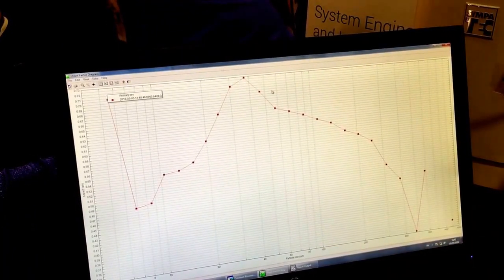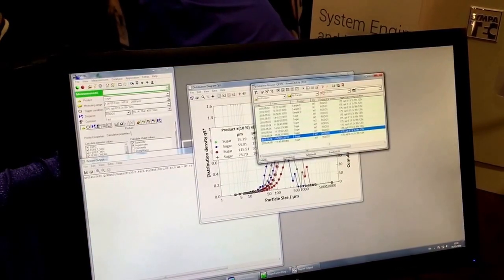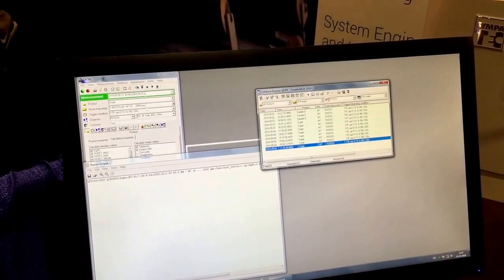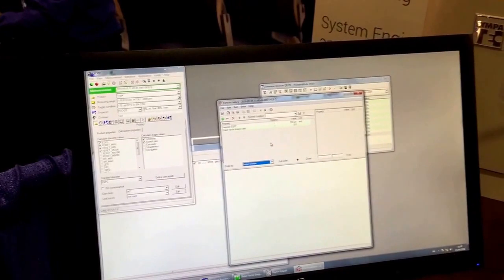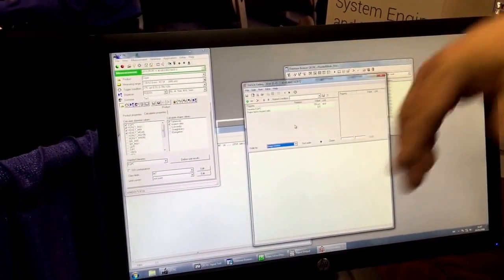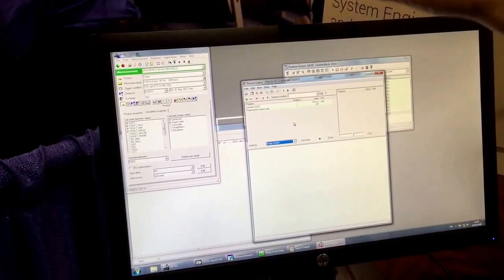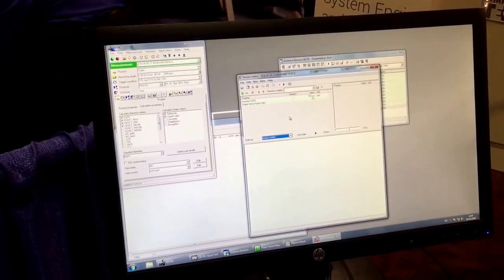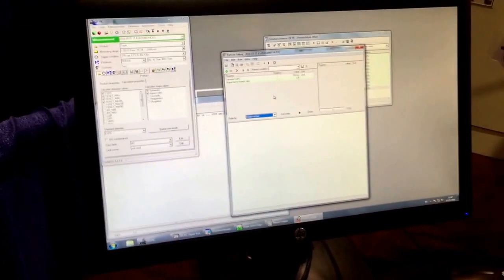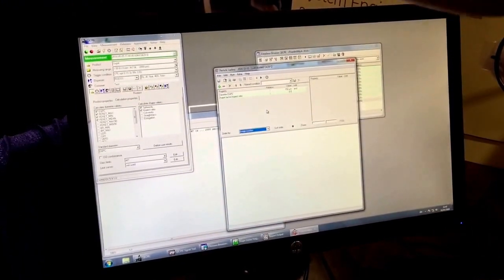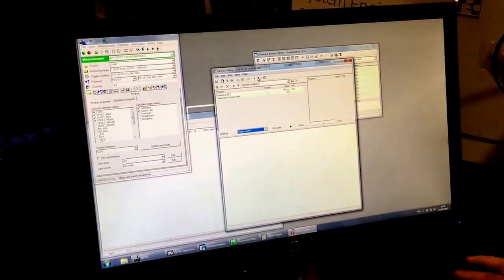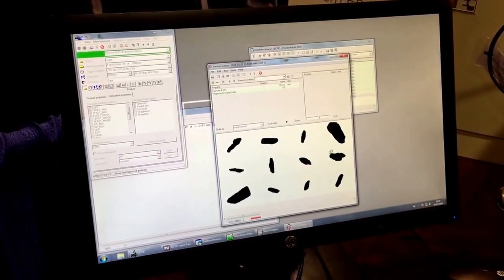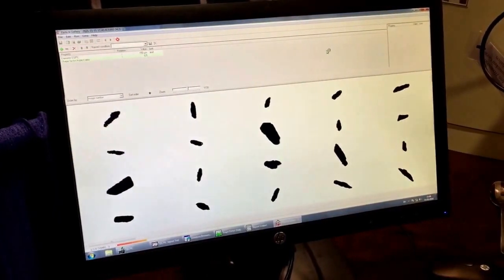And so maybe I want to look at some of these guys. So there's a particle gallery, so we will go to that. And now I can ask the system to show me particles that I'm interested in that have certain size and shape values. In this case I say, okay, show me the particles that have an equivalent projected area circle greater than 150 microns but a low aspect ratio. I want to see the long guys, for example.